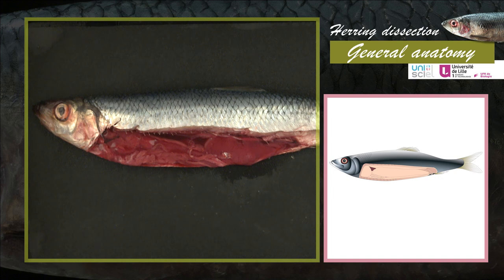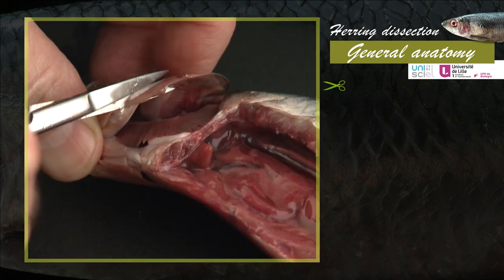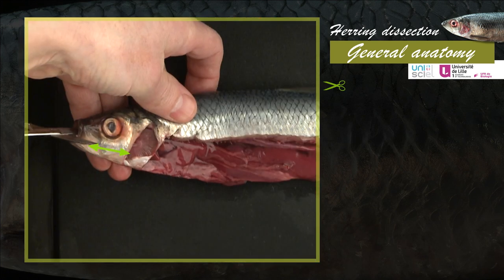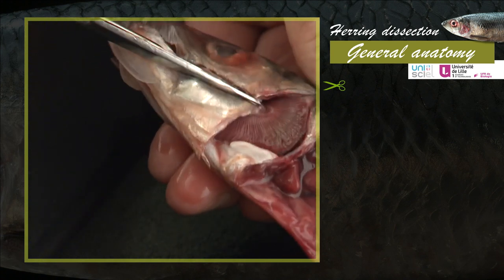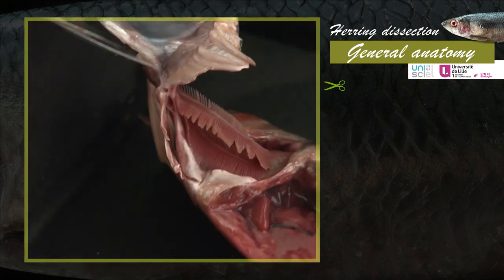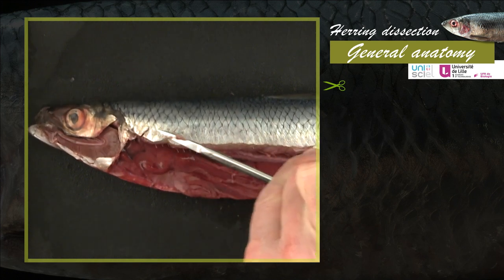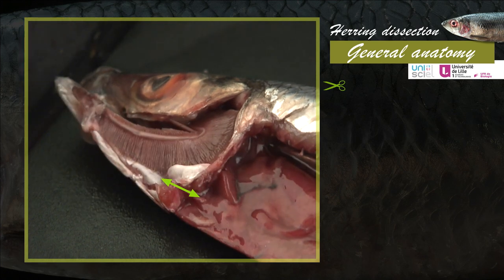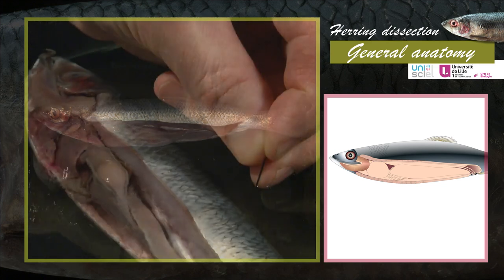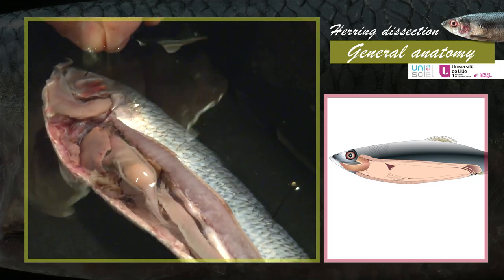The herring is then put on its right flank on the dissecting pan. Then cut the operculum and the left lower mandible in order to see the gills. Finally, cut the chest belt between the gills and the trunk of the animal. The rest of the dissection is made in water. Fix the herring in place with pins: one in the dorsal fin, one in the head, and one in the base of the caudal fin.